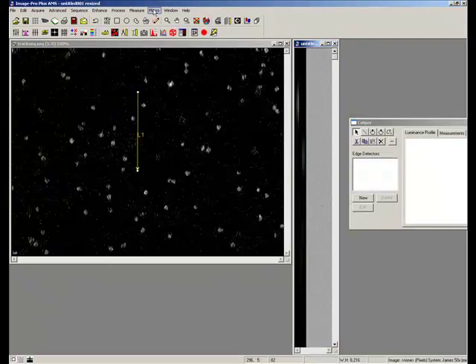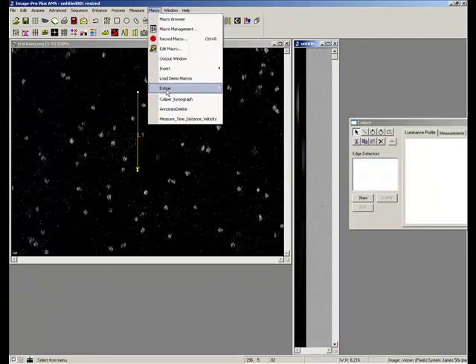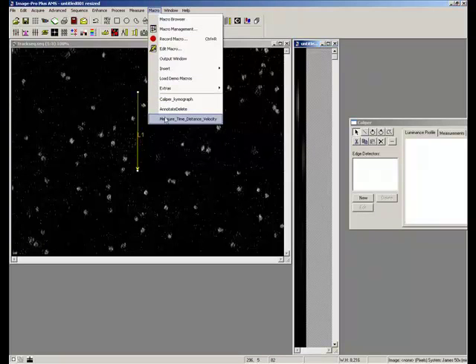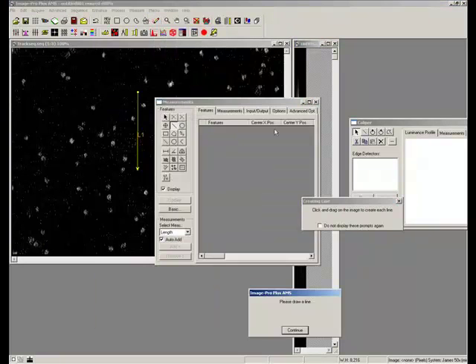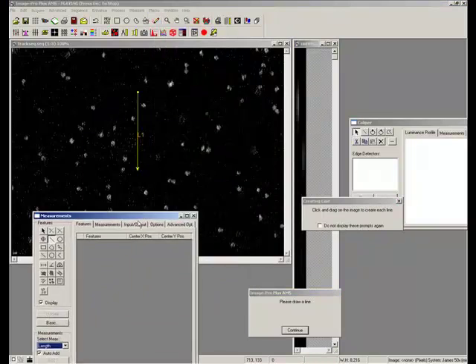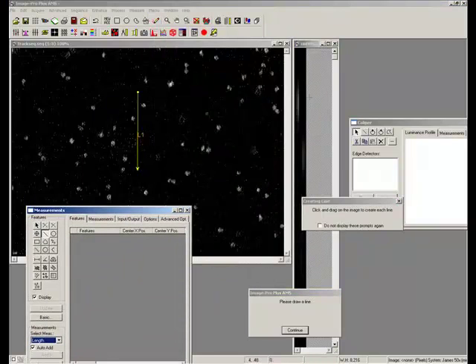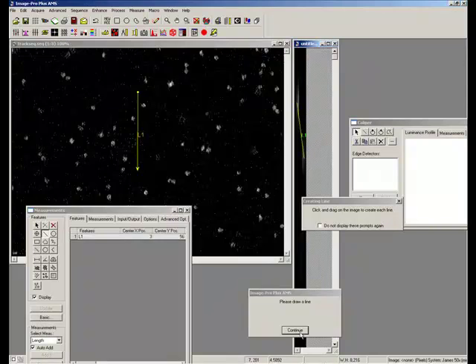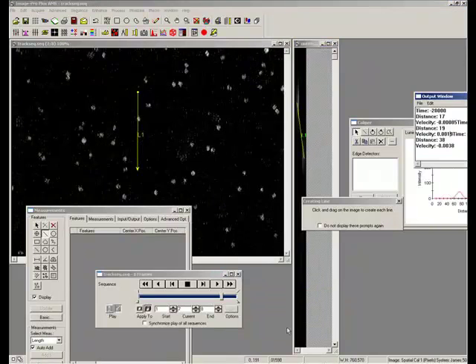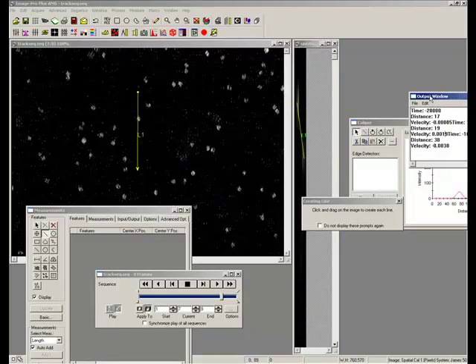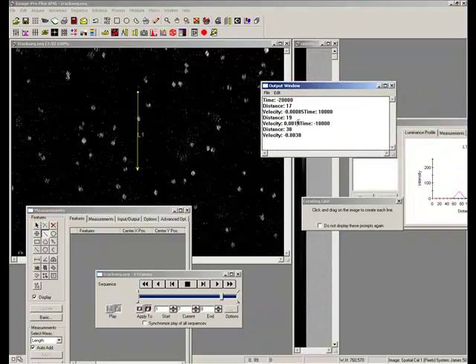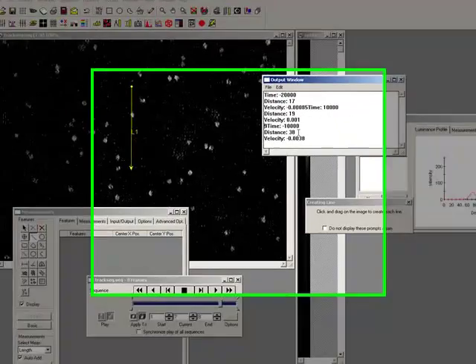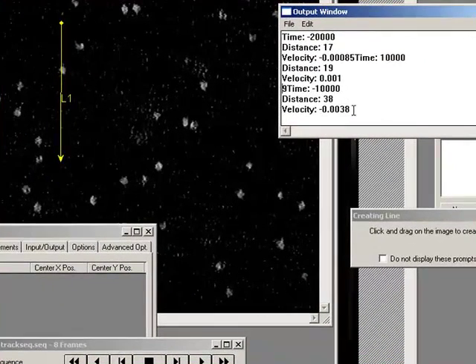You can see I have a bigger kymograph. The other thing I can do is measure the distance. Maybe I want to make a measurement here, say I want to know from there to there. I'll just press OK. You can see that I get time is this amount, distance is this, velocity is this.